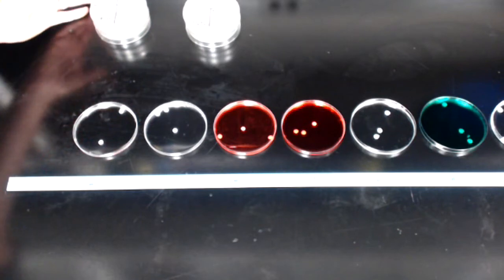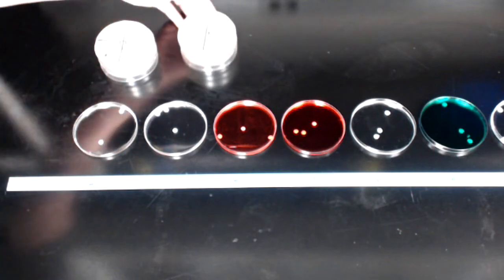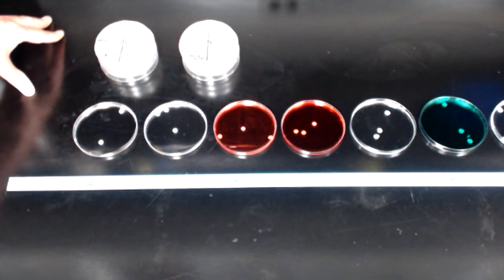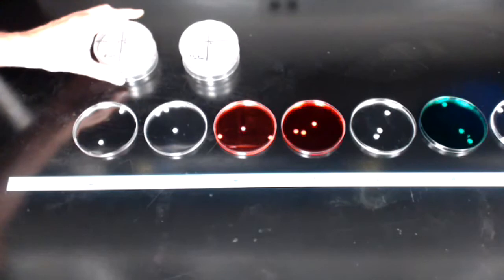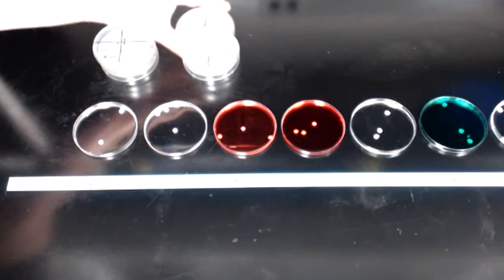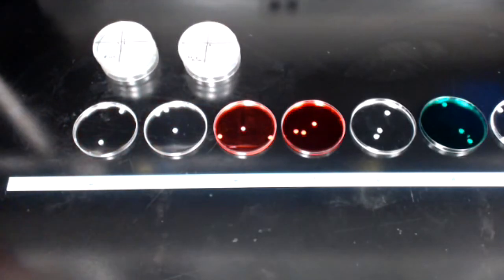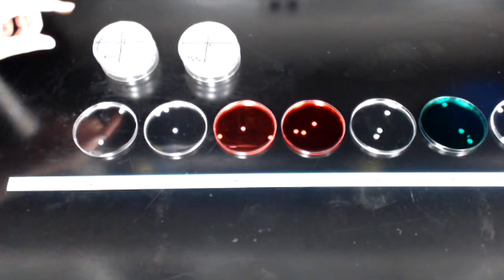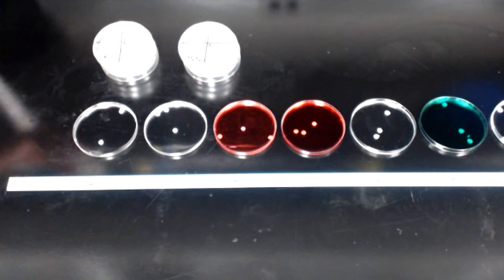What you see here in front of you is a stack of 3 E. coli plates and a stack of 3 Staph aureus plates. Each of the 3 E. coli plates have been divided up into 4 quadrants, and each of the Staph aureus plates have also been divided up into 4 quadrants. Then what I did for the E. coli is I labeled each quadrant with a different number, starting with 1 and finishing with 12.